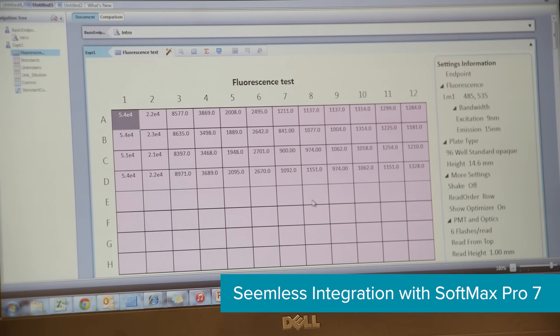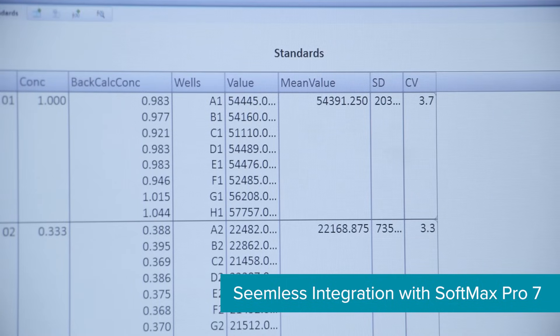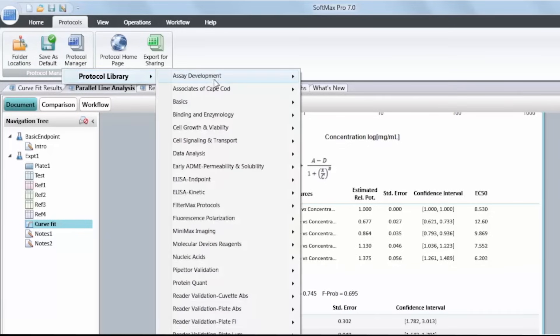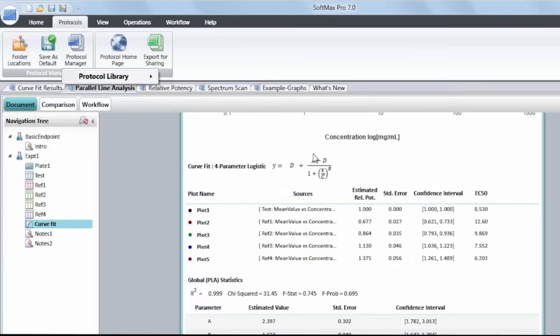Integrating seamlessly with Softmax Pro 7, the SpectraMax i3x ensures your data is always accurate, safe, and shareable at a moment's notice.